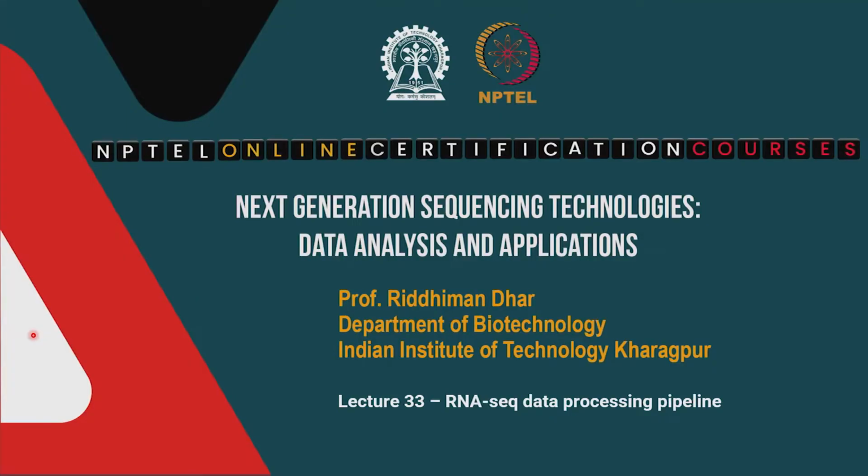Good day everyone, welcome to the course on next generation sequencing technologies, data analysis and applications. In the last class, we had an introduction to RNA sequencing. We talked about different methods, for example, short read RNA sequencing, long read RNA sequencing and direct RNA sequencing. So, we will now slowly get into the methods, right.